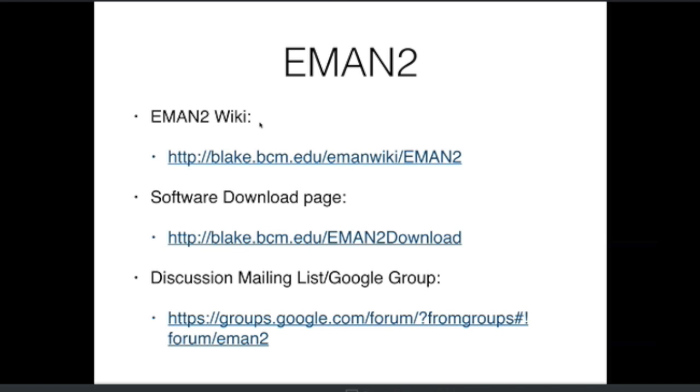So here's the basic information for Eman. There's a nice wiki page which contains all of the documentation. The wiki is blocked for people subscribing to the page as editors due to spam problems. But if you send an email to us, we'll add you so you can actually edit the pages and contribute to the documentation effort. The software download is of course available through the wiki as well, but here's a direct link to the software download.